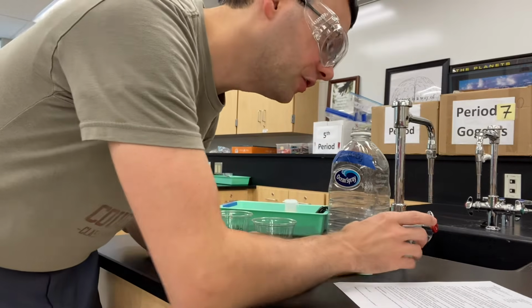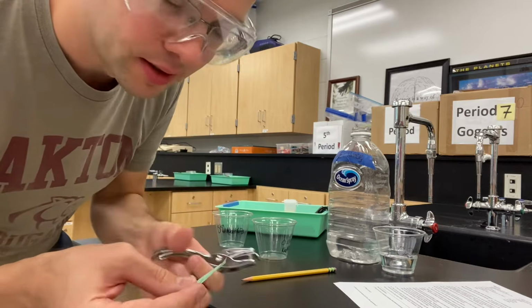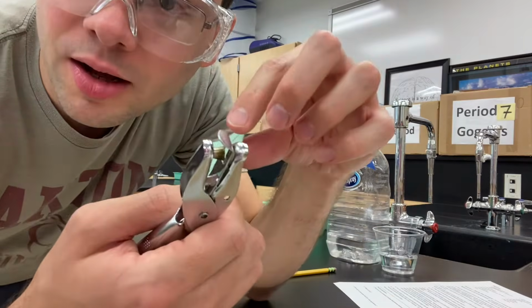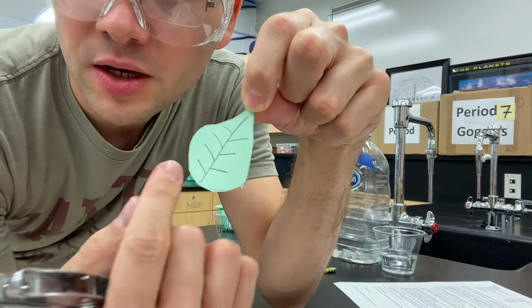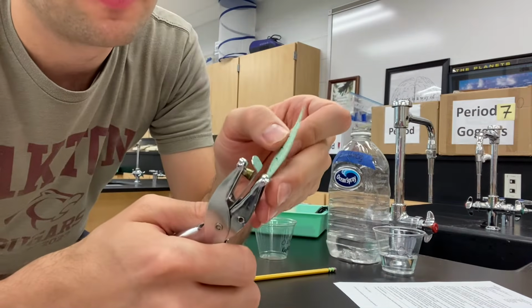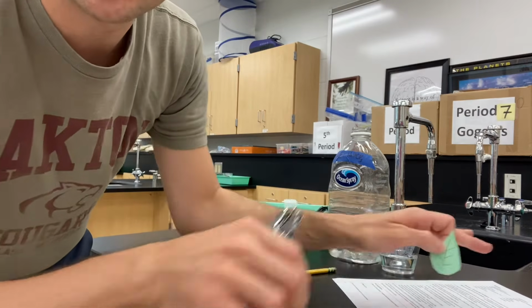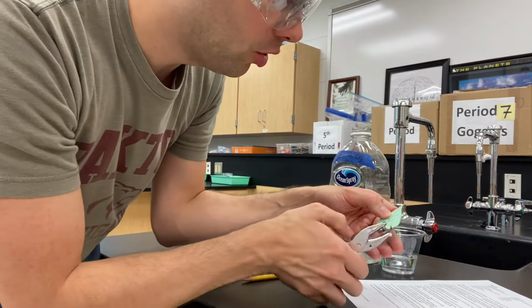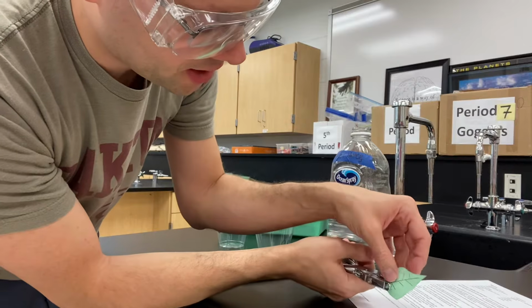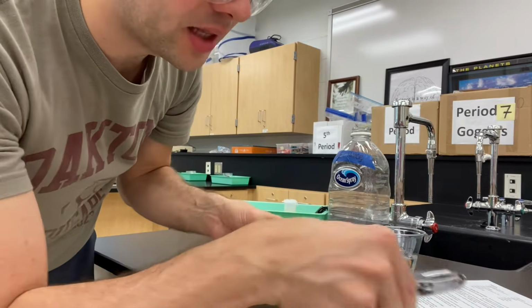Okay. The third thing you're going to do, this is a paper leaf, but you are going to have actual ivy or some other kind of leaf, depending on whatever year you're watching this video in. But imagine that this is an actual leaf. You're going to hole punch, using your hole punchers, 10 discs from these leaves onto a sheet of paper. Imagine this is a white sheet of paper on your lab bench. Hole punch directly onto it so that you can find them and you're not trying to dig around for them if they're contrasting on the back of the black lab bench.